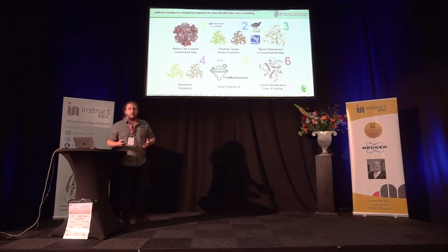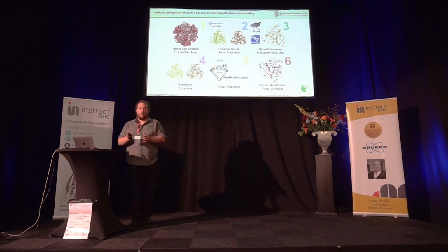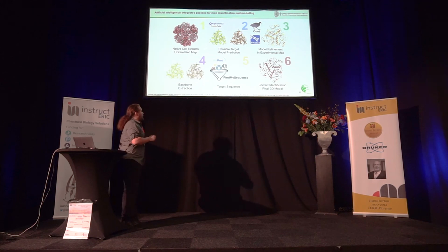As I said earlier, in the case of signature 1, we had an issue. We could not identify whether it belonged unambiguously to the branching ketoacid dehydrogenase, pyruvate, or oxoglutarate dehydrogenase complexes. To solve this problem, we collaborated with Grzegorz Chojnowski of EMBL Hamburg, who has developed various computational tools. He was one of the developers of ARP/wARP, for example. He recently published a very interesting tool called Find My Sequence, and we employed this in our pipeline for unambiguous identification.